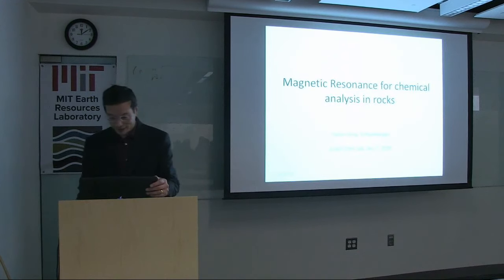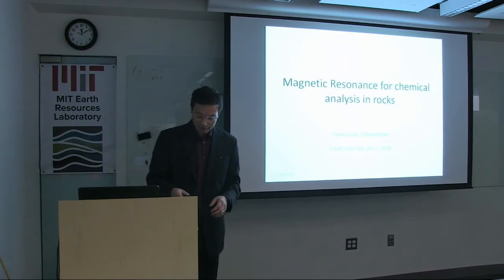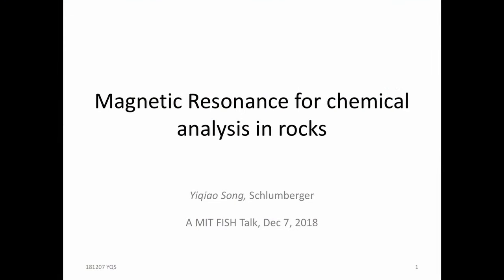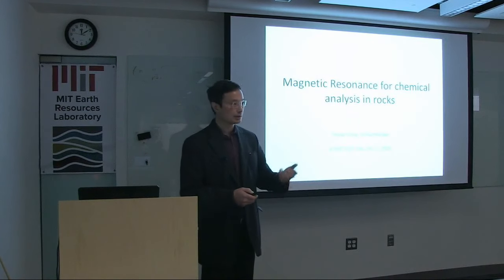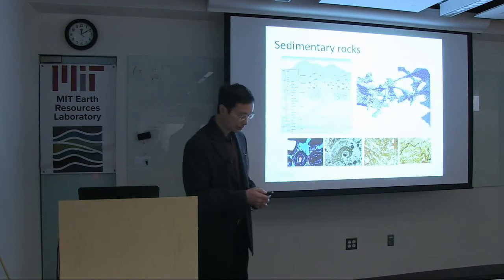But anyway, what I want to talk to you about is the connection between two topics. One is, of course, the rock that must be familiar to this audience, and the other is probably a little less familiar: using magnetic resonance techniques to understand various aspects of rock. And today, I want to focus not on a generic understanding of rock, but more on the chemical analysis of, in particular, the organic materials in various rock material.